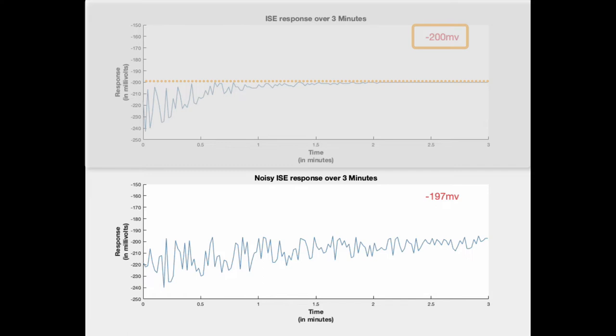Ideally, we want the reading to stabilize for all of the samples measured. If the reading does not stabilize, you can take an average of the readings over 3 minutes, recording the reading once every 30 seconds.